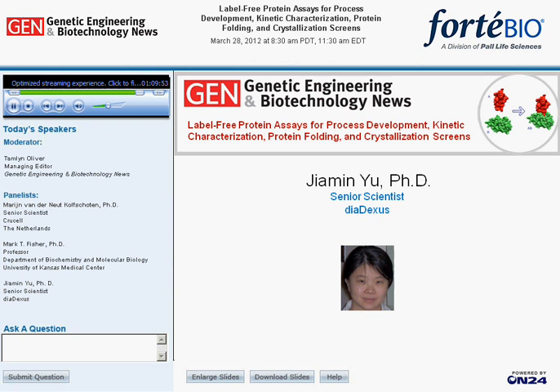And there are a couple instances where it proposes a different construct candidate. However, in those cases, you don't know what the results were, because those weren't selected in the traditional screen method, so they weren't characterized. So the binding rate will suggest that something else might work better. But overall, we say yes, the method works quite well.